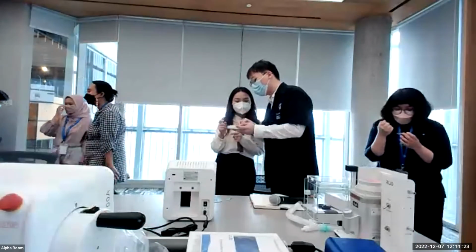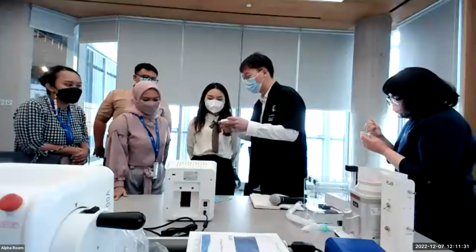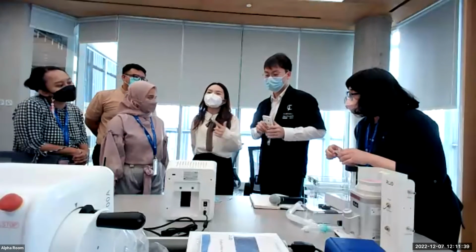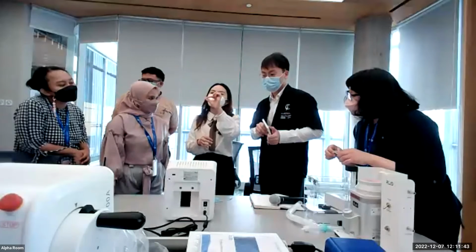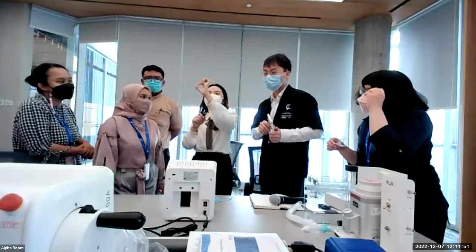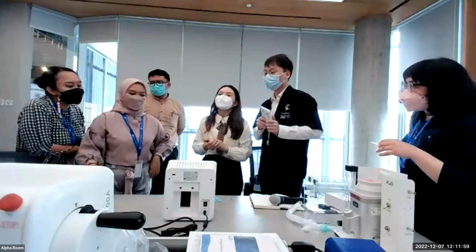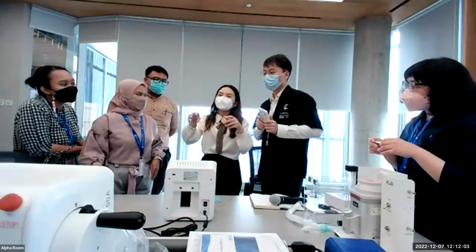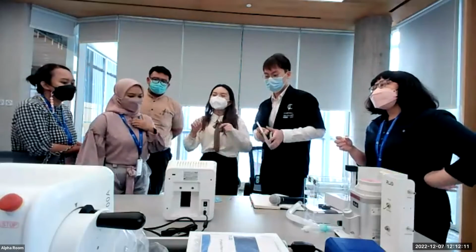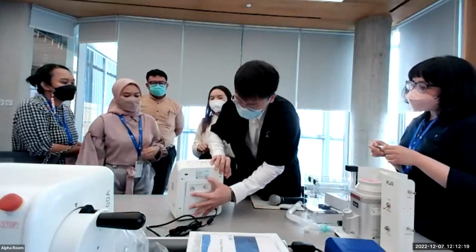The machine can record all oval-shaped objects from 4 to 60 micrometers. This device can not only count cells, it can also count yeast, or something similar to yeast. Like flowers, the pollen, that can also be counted, as long as the size is between 4 and 60 micrometers.